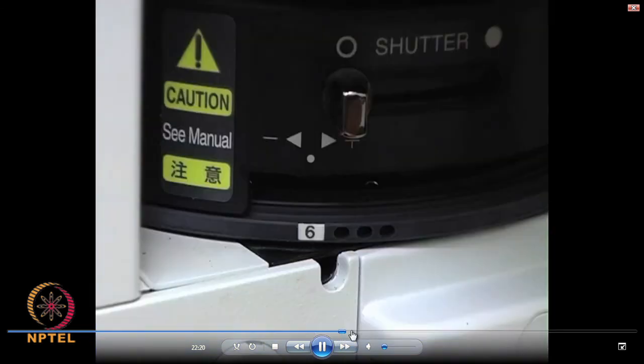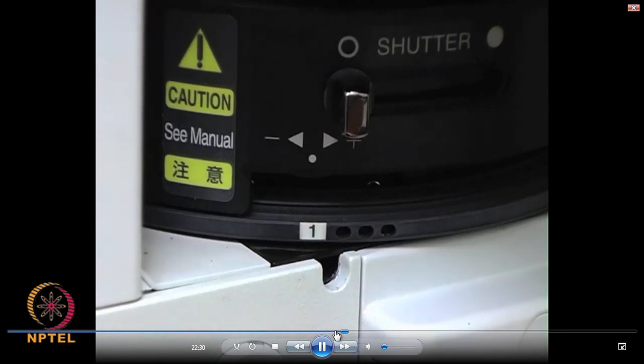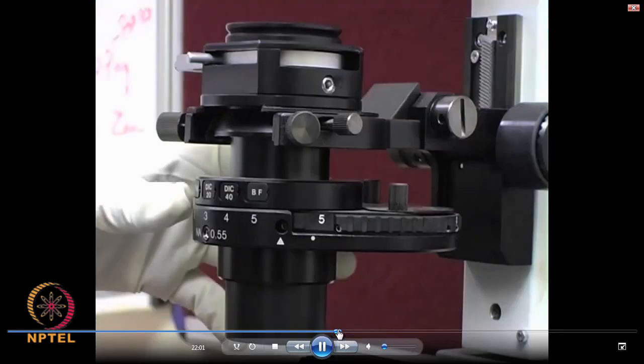So, now we will change to phase contrast mode. That means you have to change the aperture both on top as well as bottom to the phase contrast aperture and filters. And now you should appreciate this particular, let me go back.